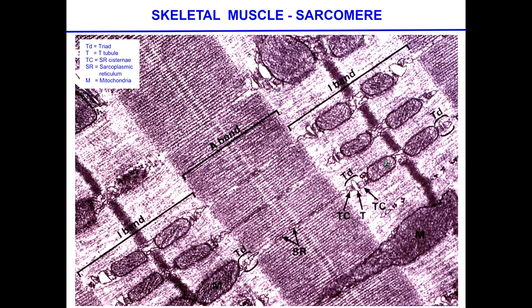As you see, there's plenty of mitochondria in there. And then we can, again, separate and distinguish the A band and the I band. And these other vesicles, which are by themselves kind of in the middle of everything, correspond to the sarcoplasmic reticulum that has been sectioned at different levels, depending on where the section was located. Questions?